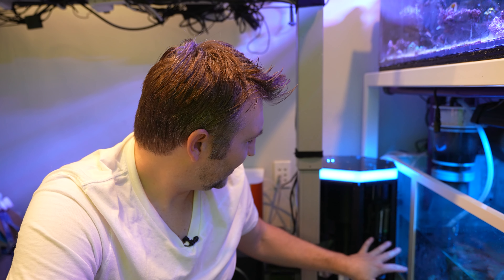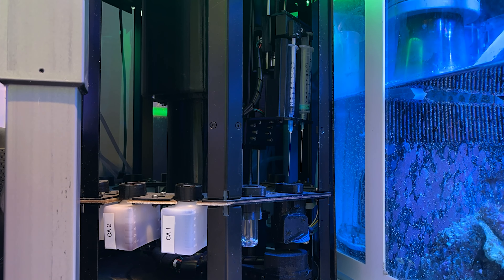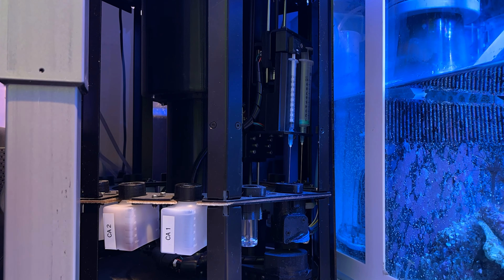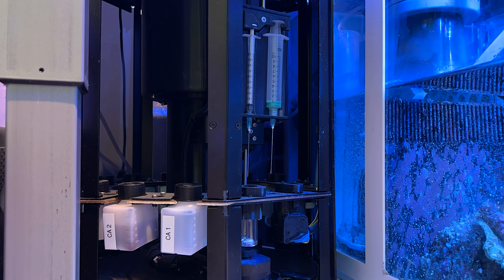Overall, this design has been working really well. The original ReefBot used a linear actuator, and mine died at one point and I had to replace it — a little bit of a pain, but fixable. This new one uses a stepper motor and a lead screw, and I think it's a better design. It's been absolutely flawless. The slightly louder noise on the lead screw just means it needs a little oil — same maintenance as a 3D printer. A couple dabs of cooking oil or machine oil should fix that.